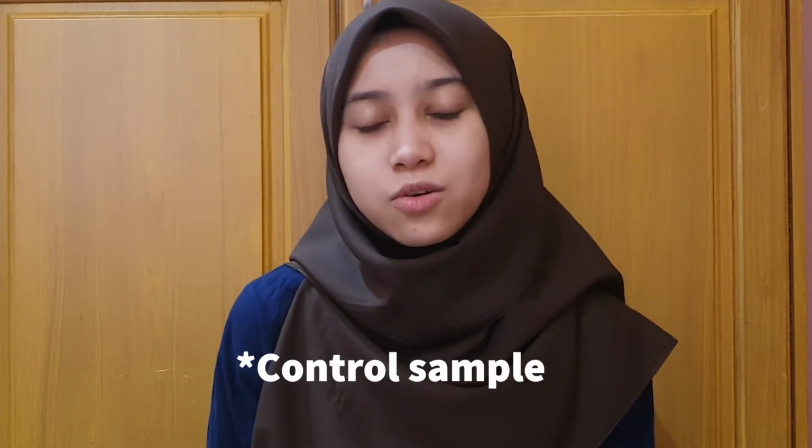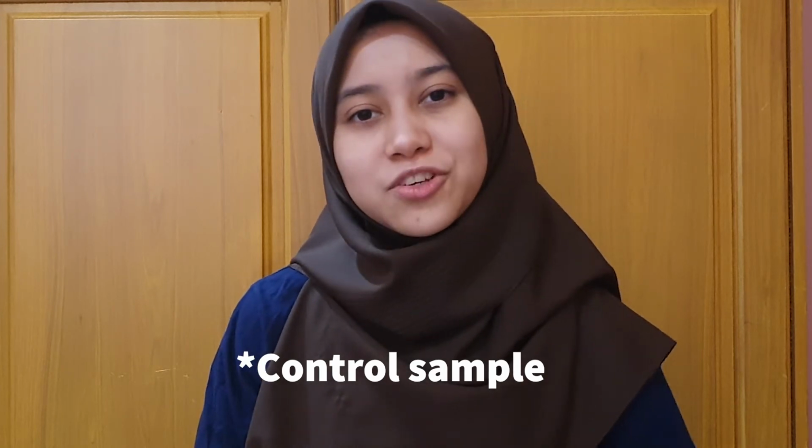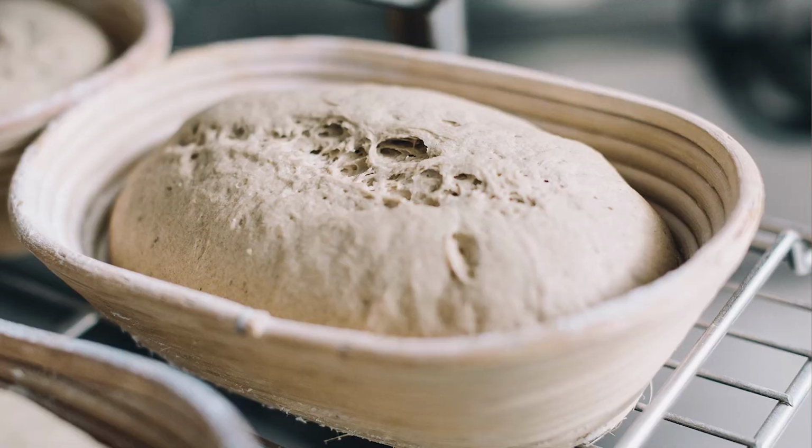In brief, fermentation by glucose syrup should inflate the most because it is a monosaccharide, but it seems that table sugar supported the fermentation more readily than glucose syrup. And then it is followed by cornstarch, which has a very slow fermentation rate, and then the control sample has little to no fermentation. A very similar process happens as bread rises.